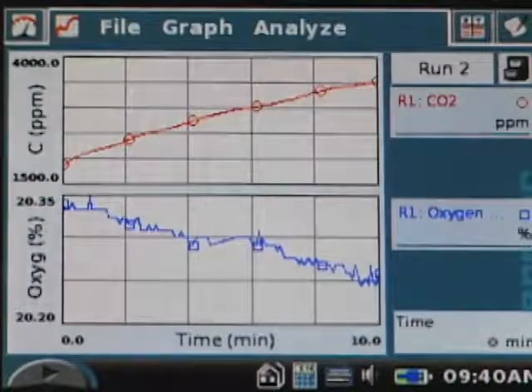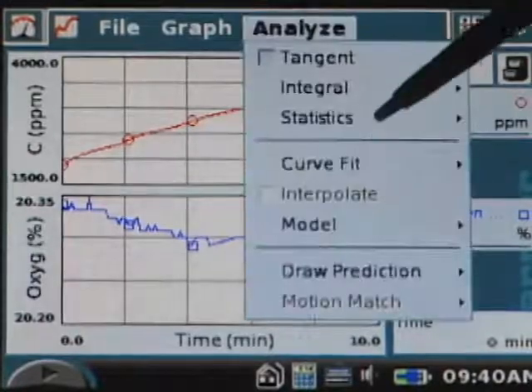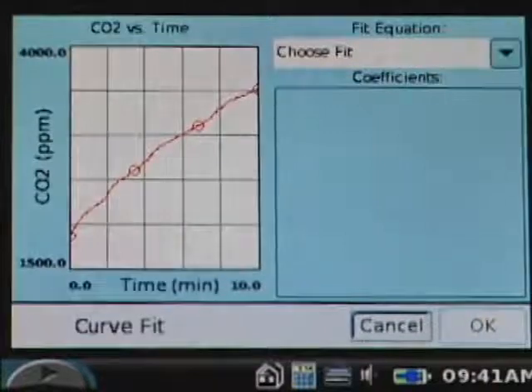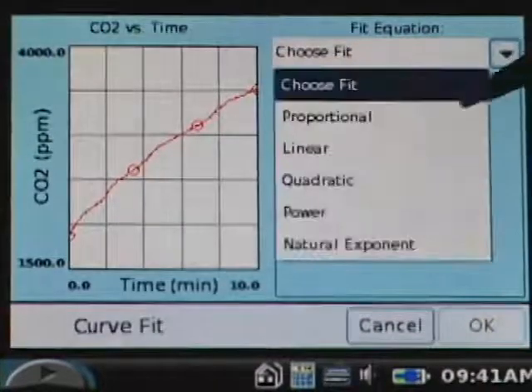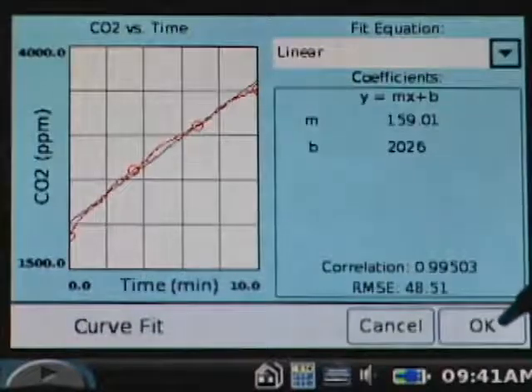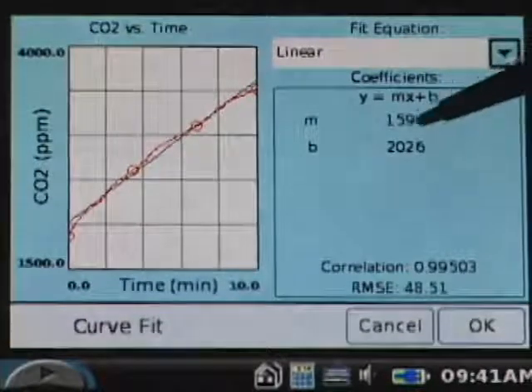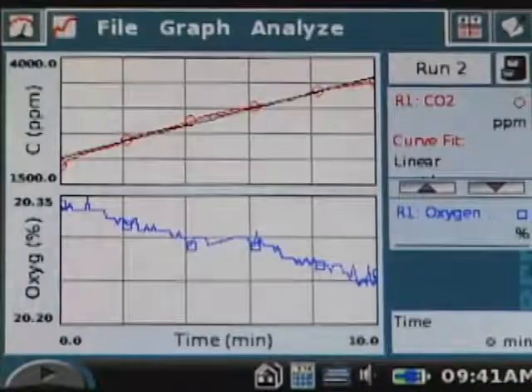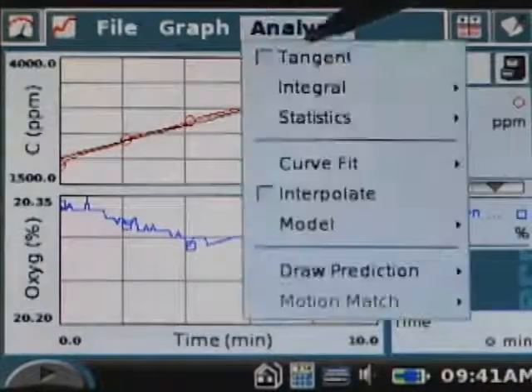To find the rate of respiration on the CO2 graph, choose Analyze, tap Curve Fit, and choose CO2. From the pull-down menu, choose Linear, and record the slope on your data table, and tap OK. Similarly, repeat the process for the oxygen gas graph.